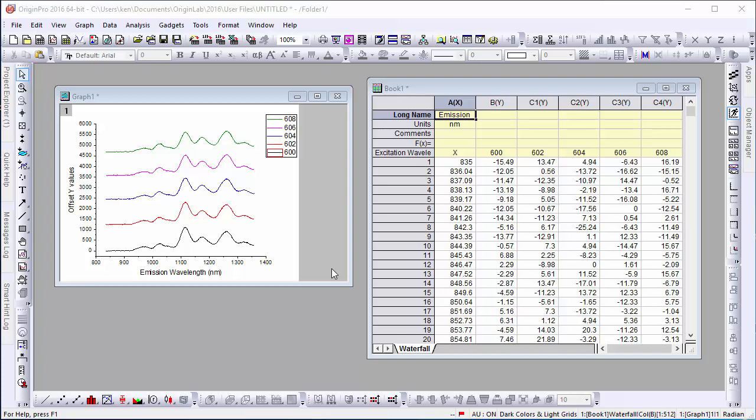Hi, this is Ken from Origin Lab. This short video will show you how to place legend labels next to each curve on a graph.